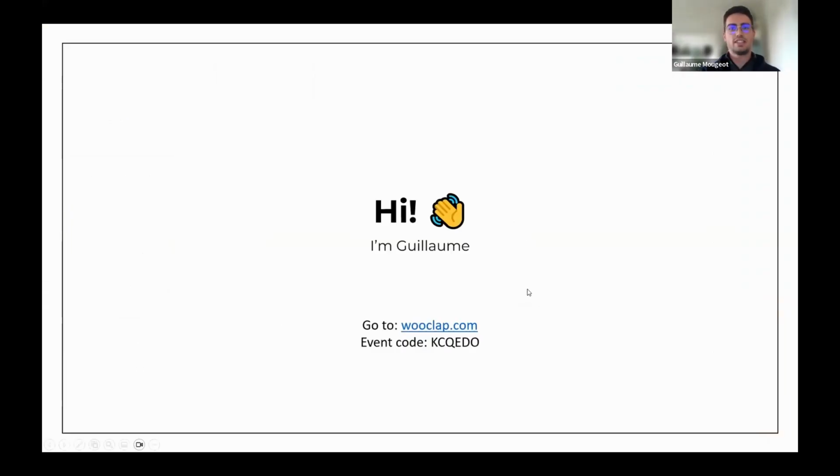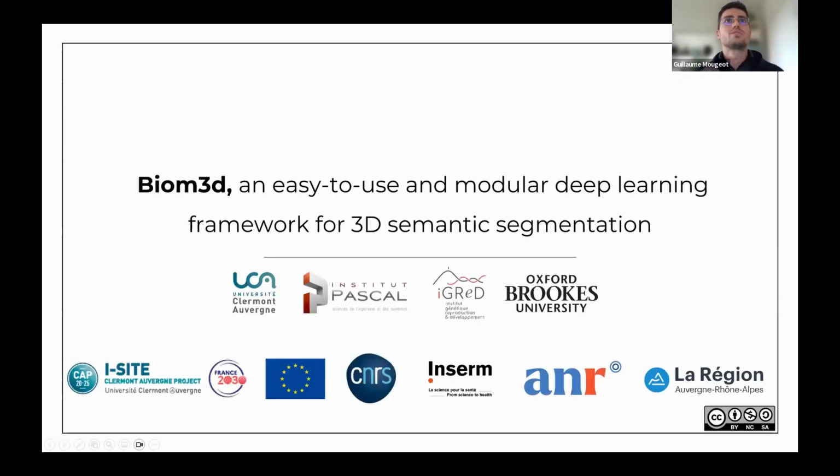Today I'll talk about Biom3d. I'll give a short presentation of 15 to 20 minutes, and then I'll switch to an interactive demo, so everyone can experiment with the software.